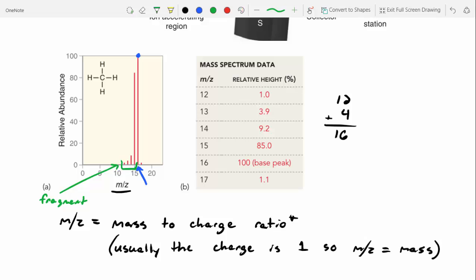All right, so let's discuss terminology a little bit. The big peak that we see here is scaled to 100%. Oftentimes that's called the base peak or just the biggest peak. The peak that's furthest to the right is called our parent peak or our molecular ion. People will oftentimes abbreviate this as M+• (M cation radical). That's just our parent radical cation where we dislodged one electron. Then down here, we've got M+1 radical cation, which we said is due to our heavier isotope of carbon. And everything below that are cationic fragments, probably due to loss of a hydrogen.